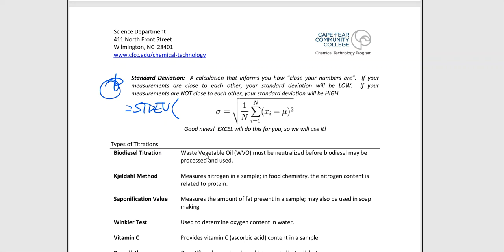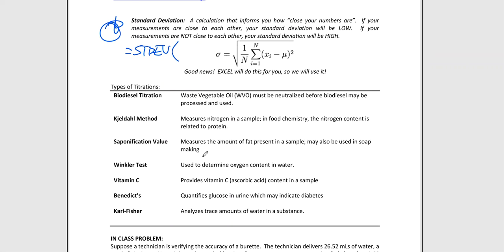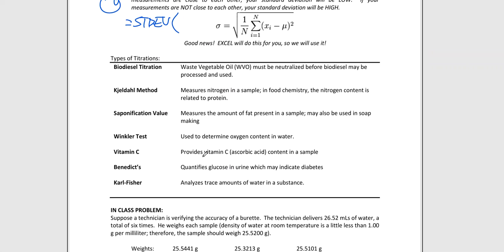to each other. A couple of different types of titrations. I just mentioned this idea or concept of acid and base, and that is one of the versions, but we've got so many other reasons to use titrations and to use burettes and even automated titrators, of course, and I've listed just a couple of them here. So up here at the very top, it's a biodiesel titration, and you actually do this in the summer course that is going to be required of the program.